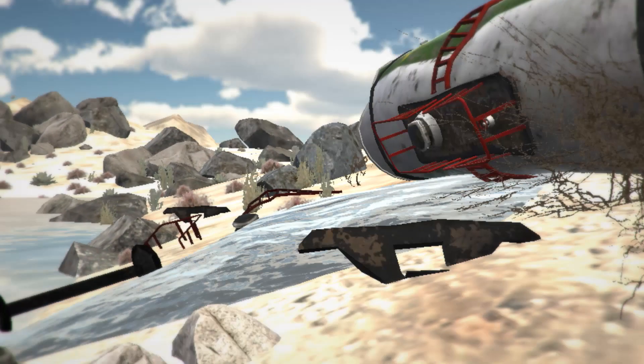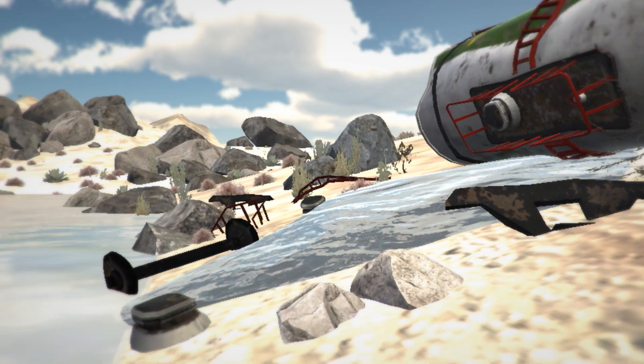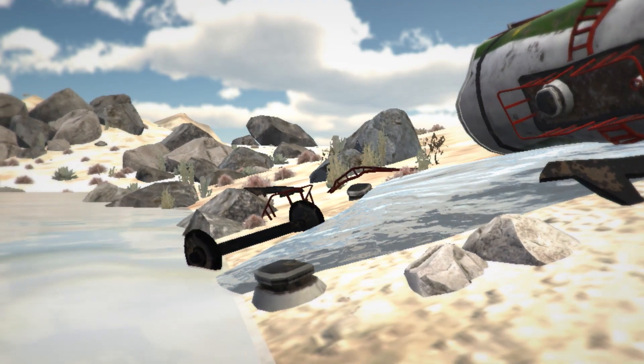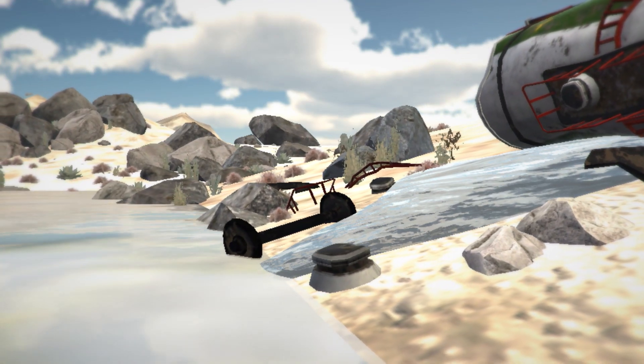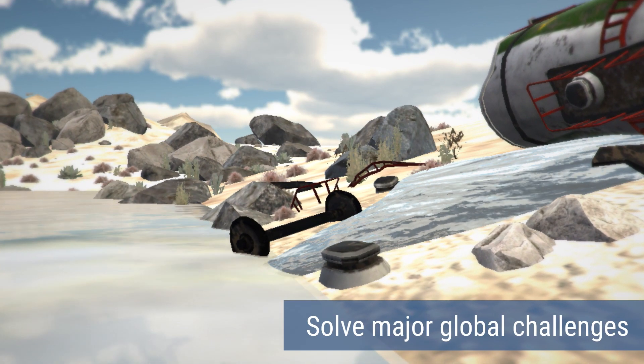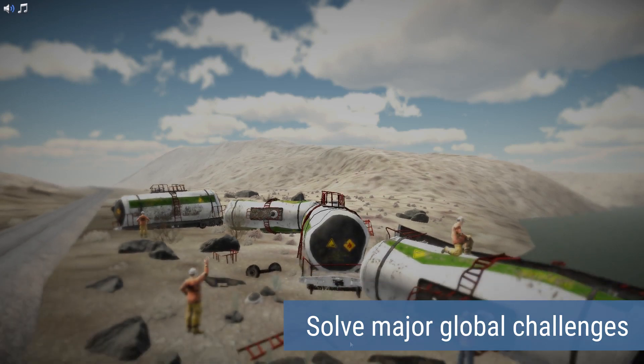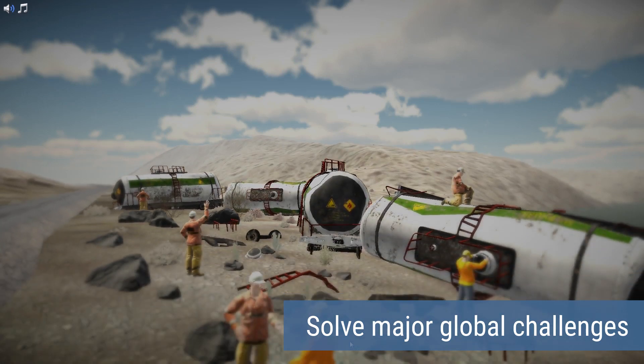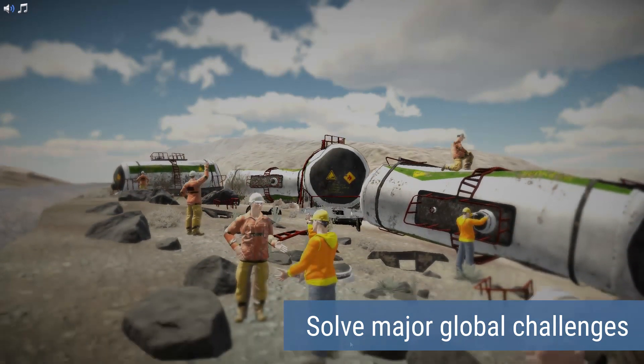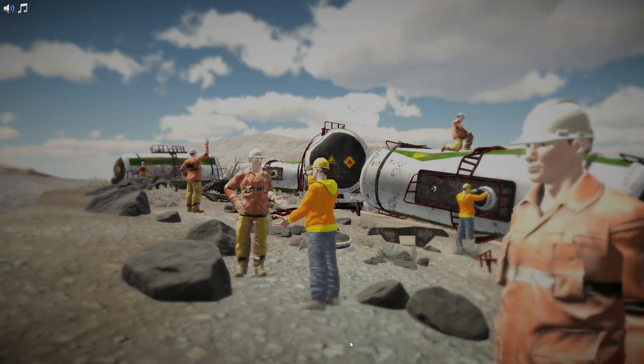The whole mission is to help the local wildlife that is being threatened by a massive acid pollution in the lake. Will you be able to apply your new skills to help avoid a major catastrophe?